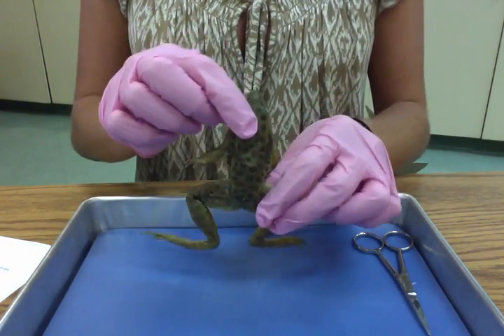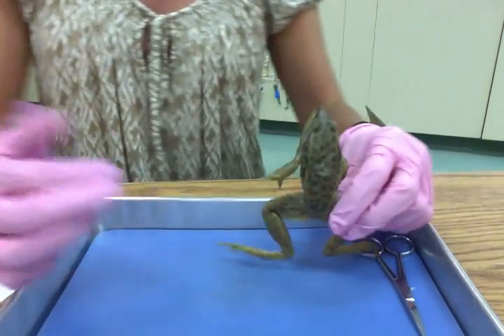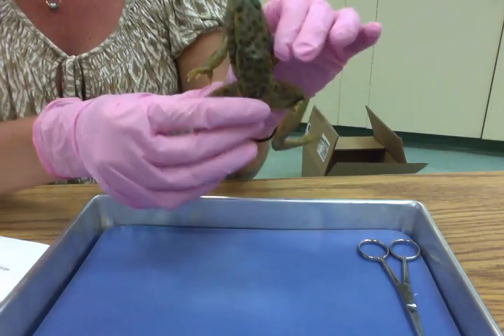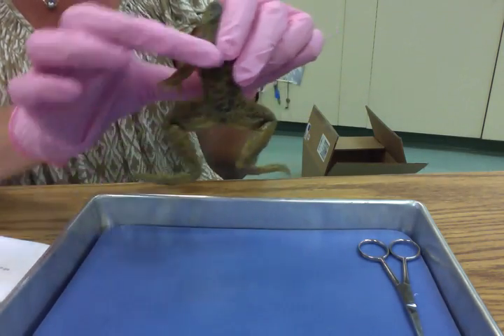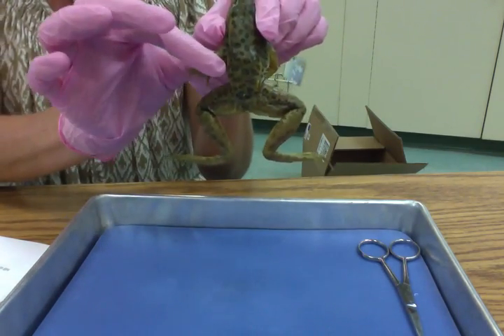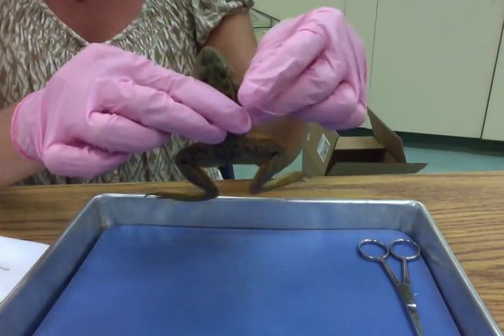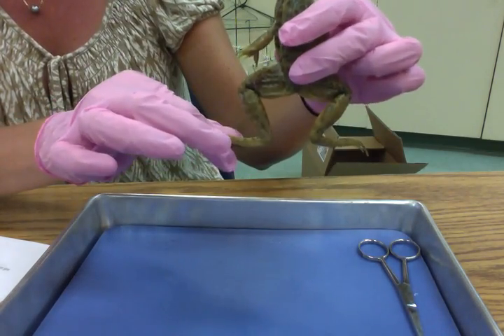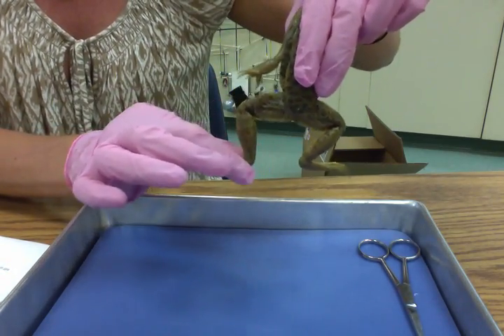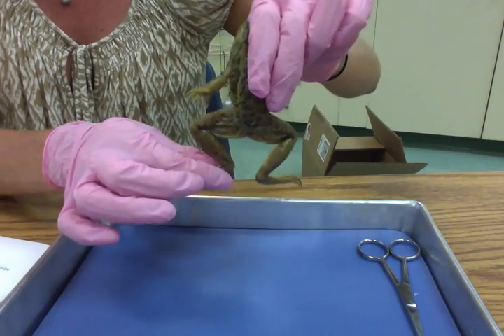Next, we're going to take a look at the frog's limbs. I realize my shirt is almost the same pattern as the frog, so let's see if I can make it show, there we go. So the two front legs are called the forelimbs, and the two back legs are the hind limbs. Take a look at the difference between these two limbs. Talk about that with your group for a second. Record in your notebook, what are the similarities between the forelimbs and the hind limbs? And what are those obvious differences? I mean, we look at this little guy up here versus this huge hind limb back here. You see that frogs have jointed appendages, right? Kind of like humans.